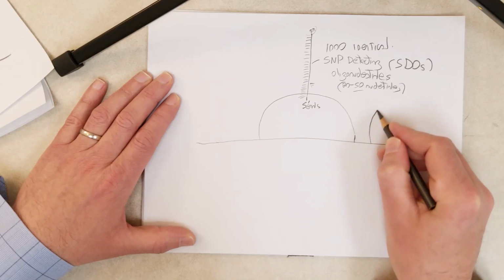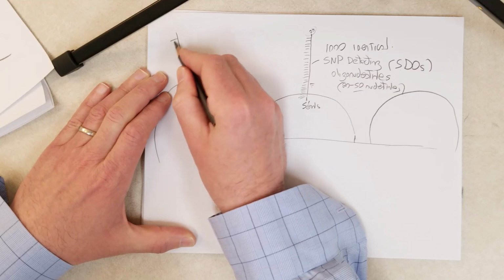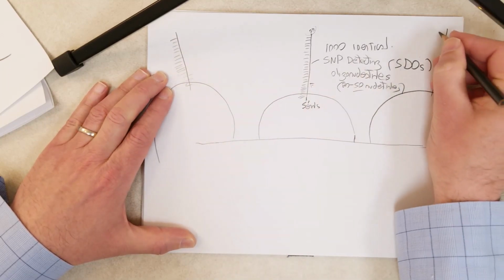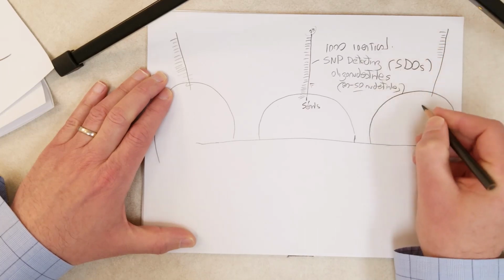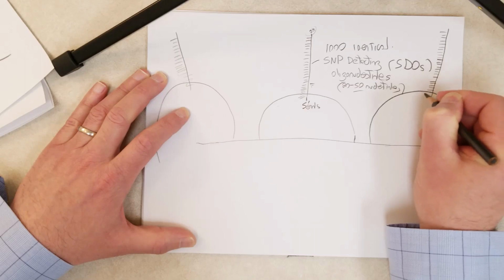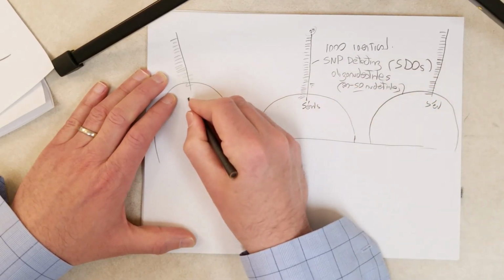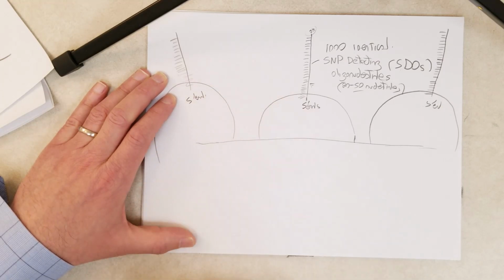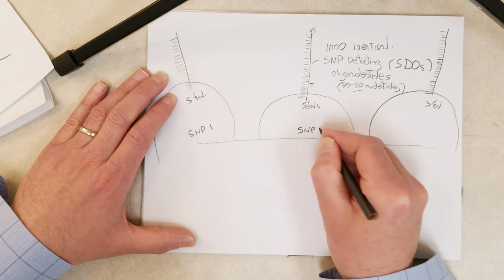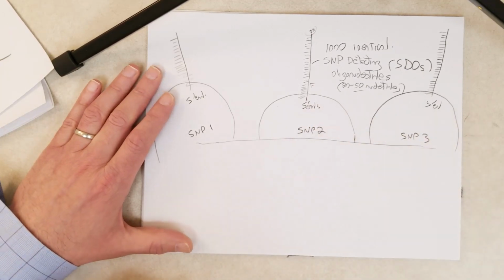Okay, that's one bead there, and there'll be another bead over here, and another bead over here. Each one has a different SDO. Each one has 1,000 SDOs, but each SDO has a different sequence. And each sequence is designed to genotype a different SNP. So let's say this one detects SNP1, this one detects the genotype of SNP2, this one detects the genotype of SNP3.